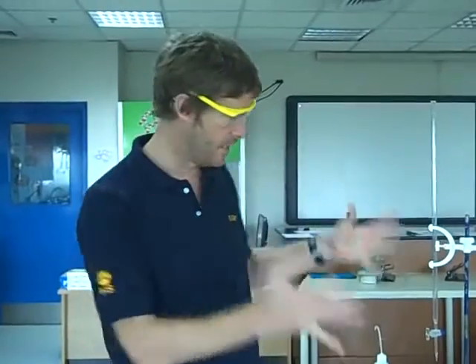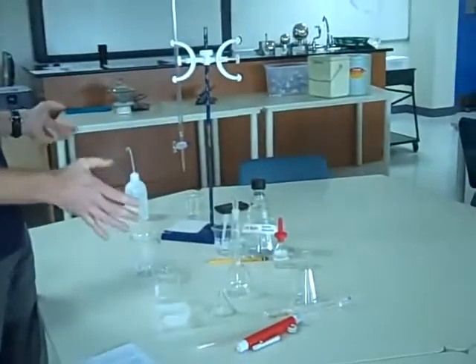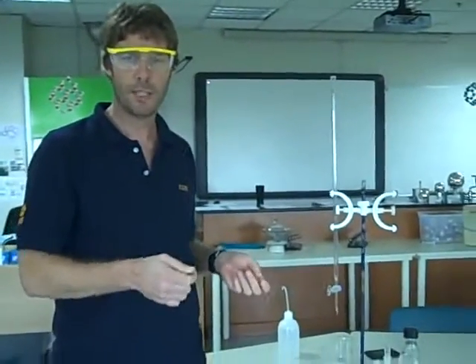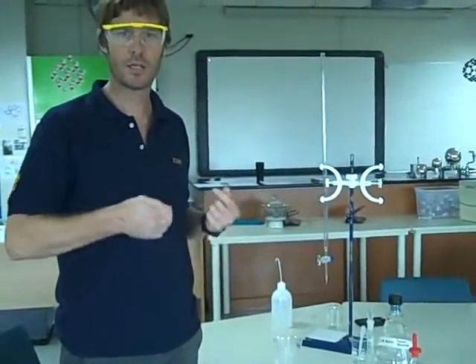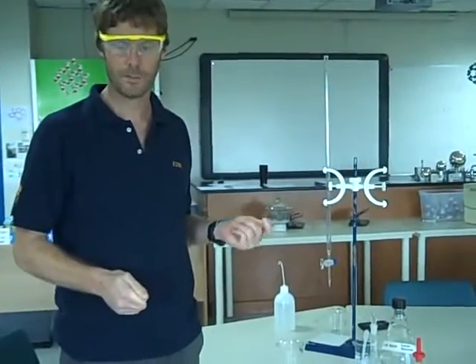Okay, hello everybody. Well, here we are. I'm going to give you a brief introduction on how to carry out a titration, because it might be the first time you've used any of these apparatus, the kind of apparatus here which is really specific, volumetric apparatus for measuring accurate and precise volumes of liquids.